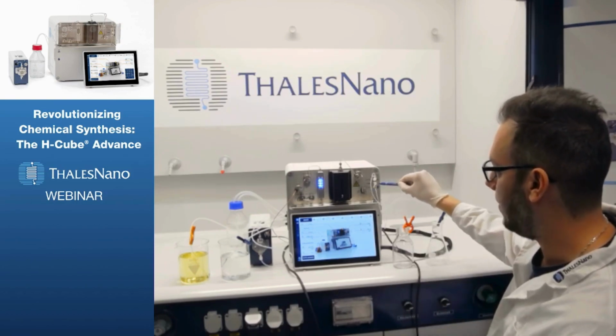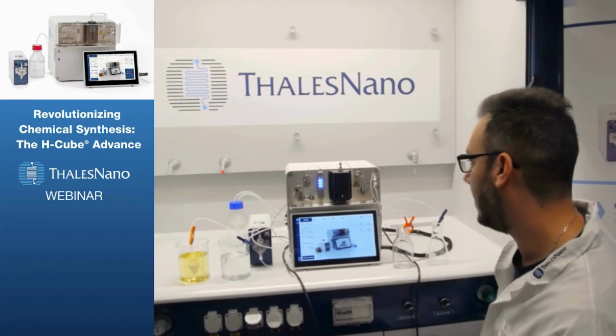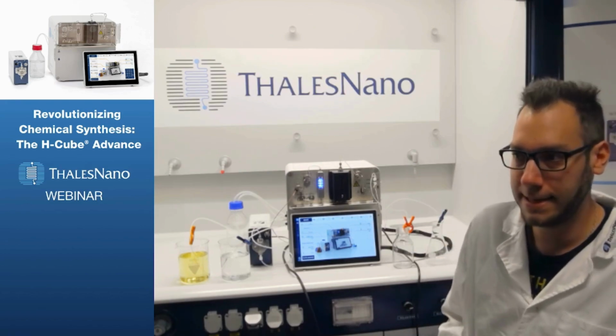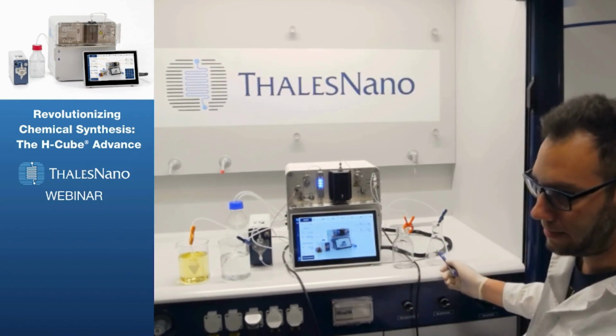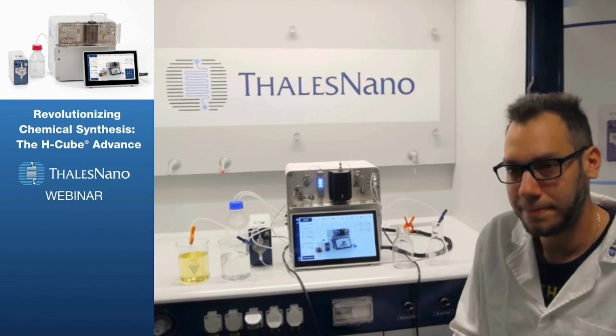And then the last step of the flow path is a similar selector valve that you can see on the inlet side, except this one allows you to switch between the product and the waste collection. So at the moment, they are both connected to two empty flasks. And one of them is going to be our waste collection, and the other one, the product collection.